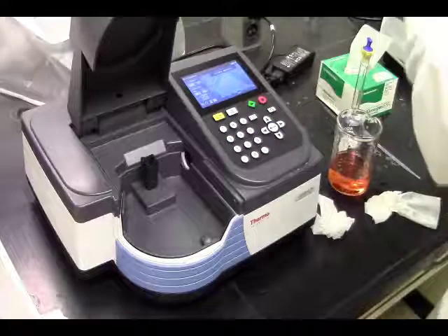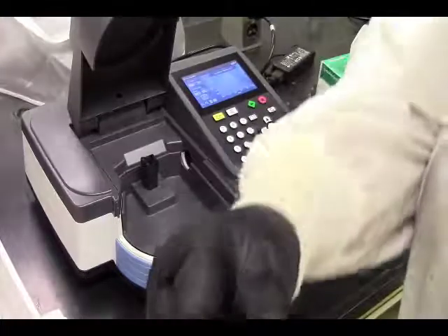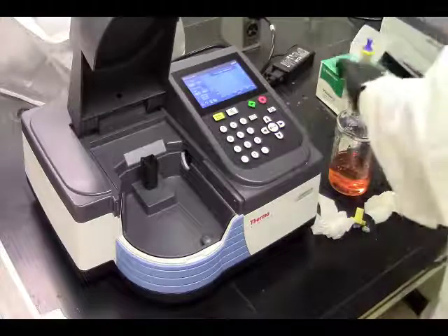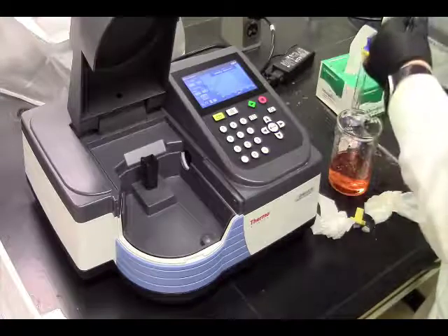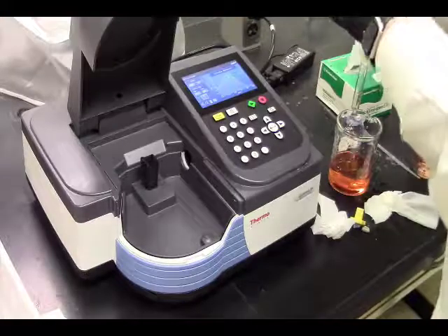We'll still need to rinse several times. Oh wow, the top of that just broke. Did you see that? Wild. Okay, that must have seen one too many days of acid because it was degraded. 3 rinses. We will fill with this one. Pop it in. Read it.